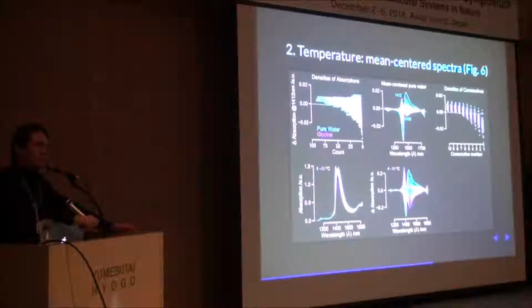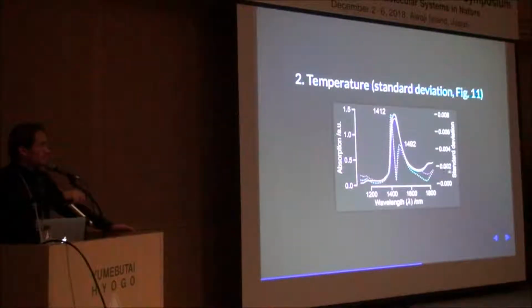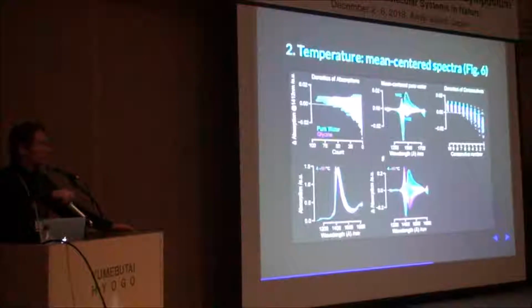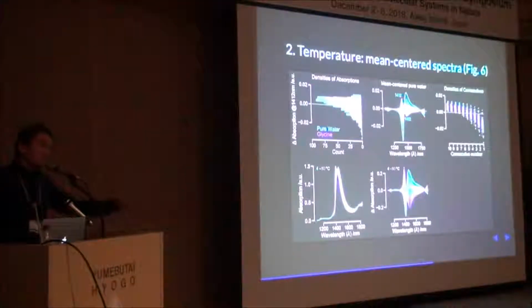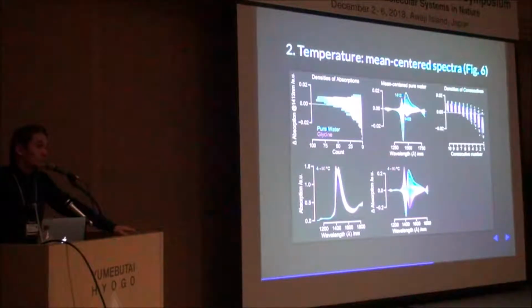And why is this important? I showed you this in a previous slide. If you understand that your near-infrared bands are at the third decimal, and your temperature variation is at the second decimal, it means that your temperature variation is 10 times higher than your bands. So you're not going to be able to effectively extract them because there's a 10 times larger shift happening with temperature. So unless you deal with temperature in some way, and that's where the whole pre-processing story comes in, you're not going to be able to understand where the bands come from. Are they coming from temperature or both?